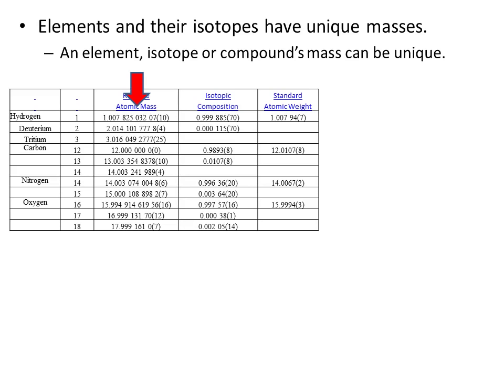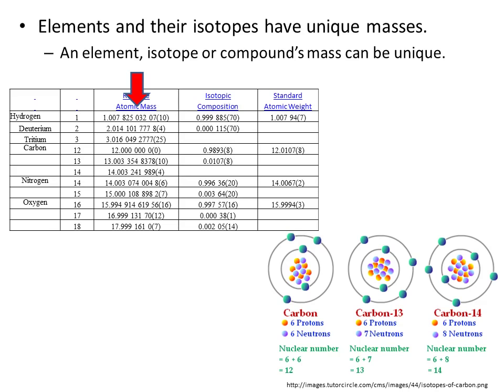Carbon has 3 isotopes, which vary by the number of neutrons in their nuclei, but otherwise they are chemically identical. The carbon-13 isotope is only a very small proportion of the total carbon on the planet, but it is extremely important for mass spectrometry, as we will see.